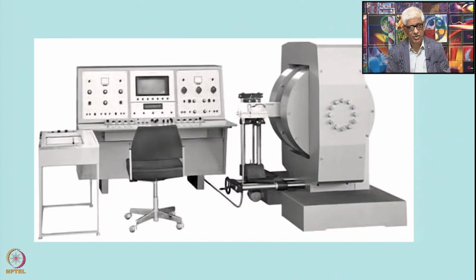So this was one of the conventional electromagnet. Now here with the electromagnet you have the FT-NMR spectrometer. But with the electromagnet there is a certain limit as to how much you can go with respect to the field. That is because a large amount of current has to be passed and that will result in substantial heating of the system and a huge amount of space will be required. You have to cool the magnet, all of that will be required. And therefore, there is a limit on how much you can go with respect to the magnetic field.